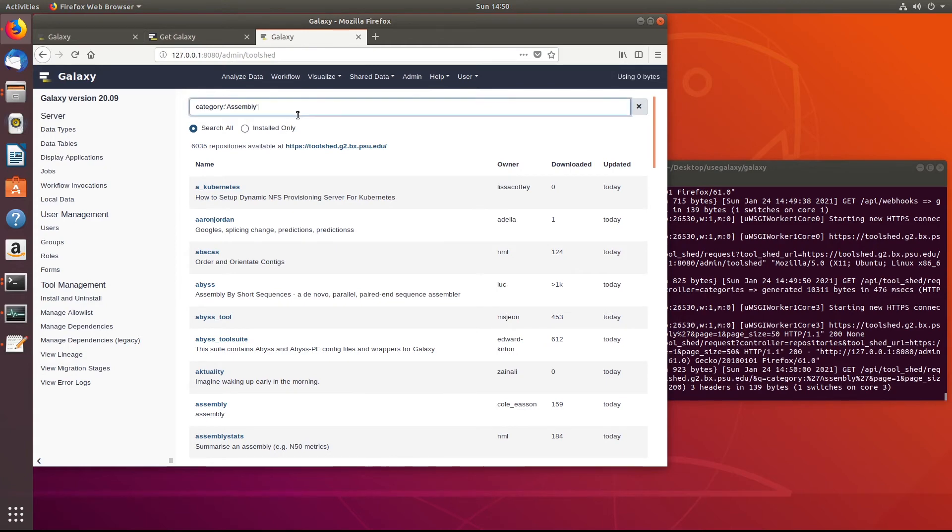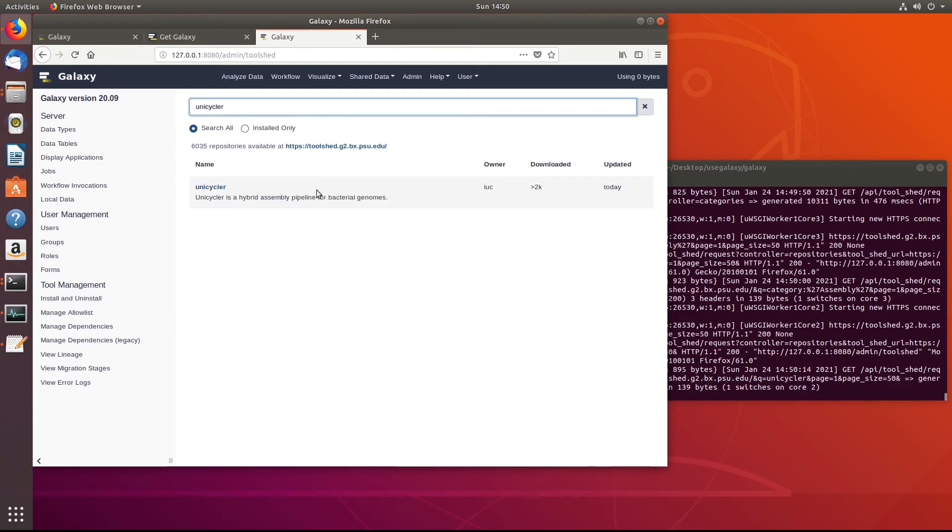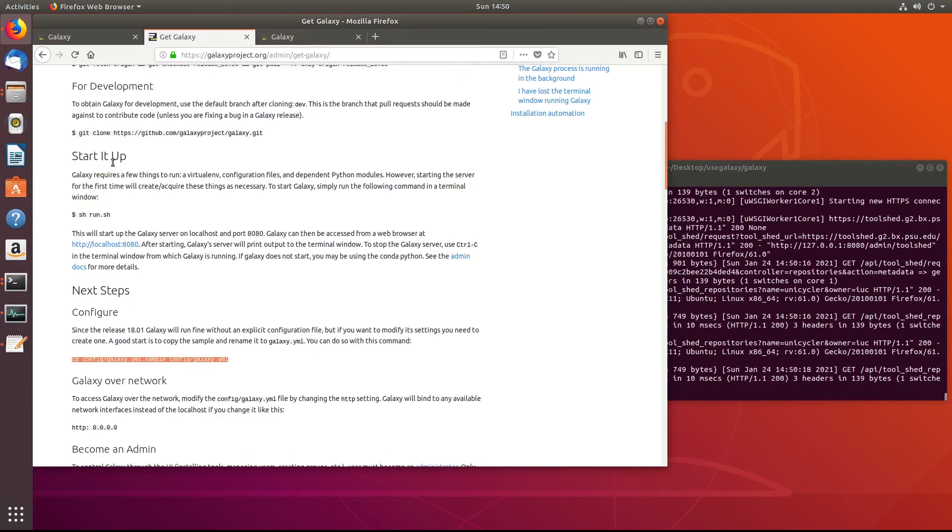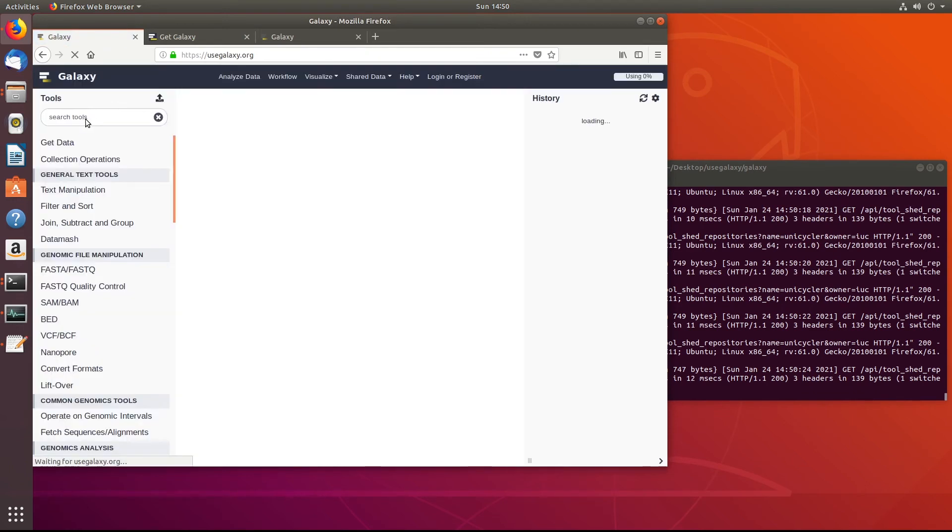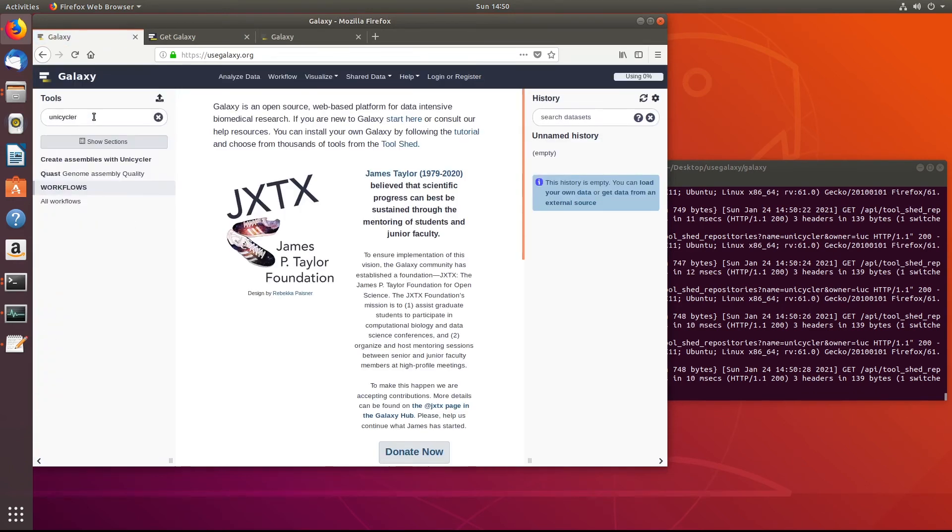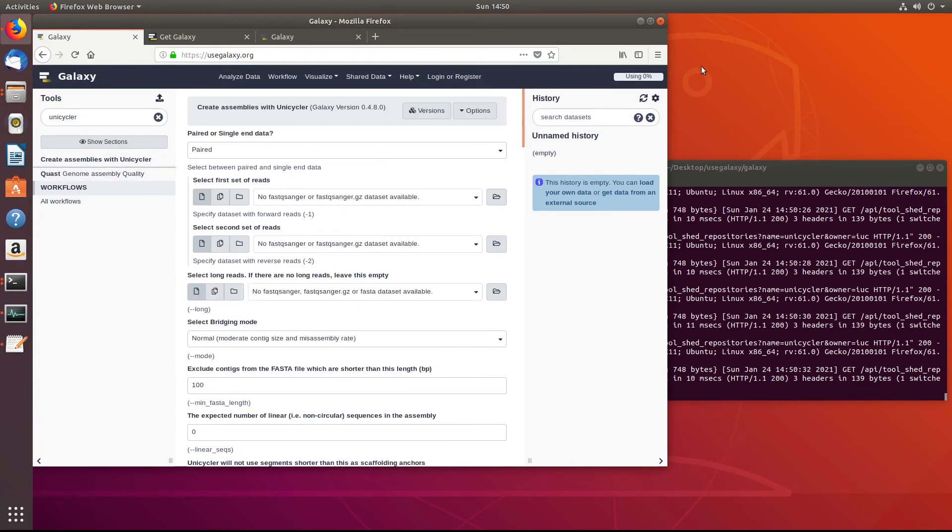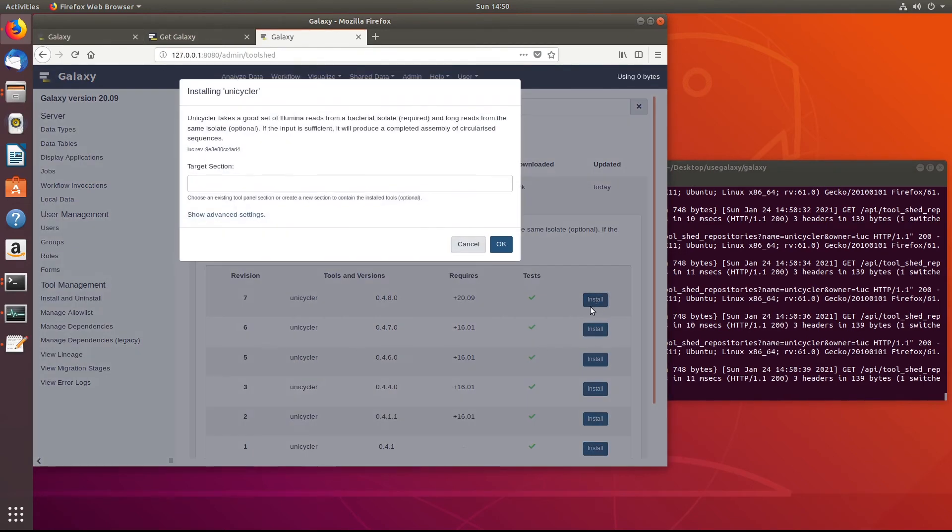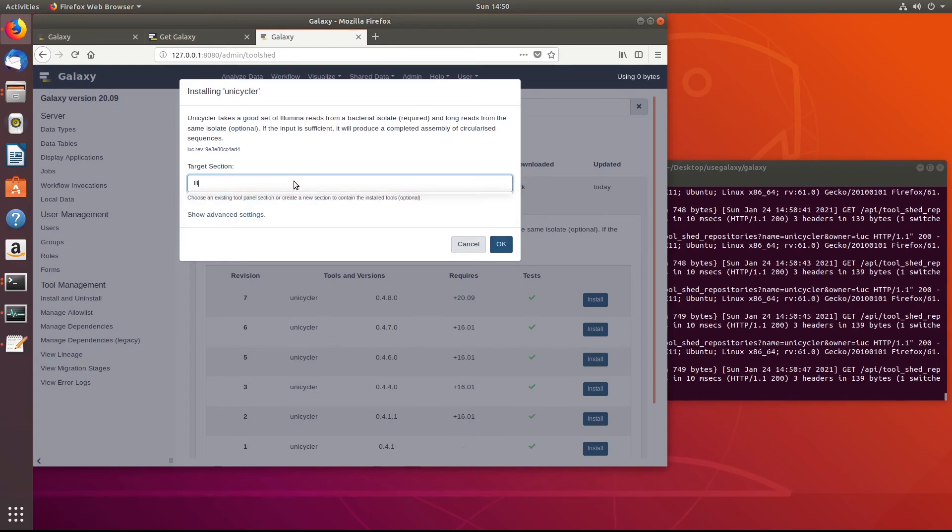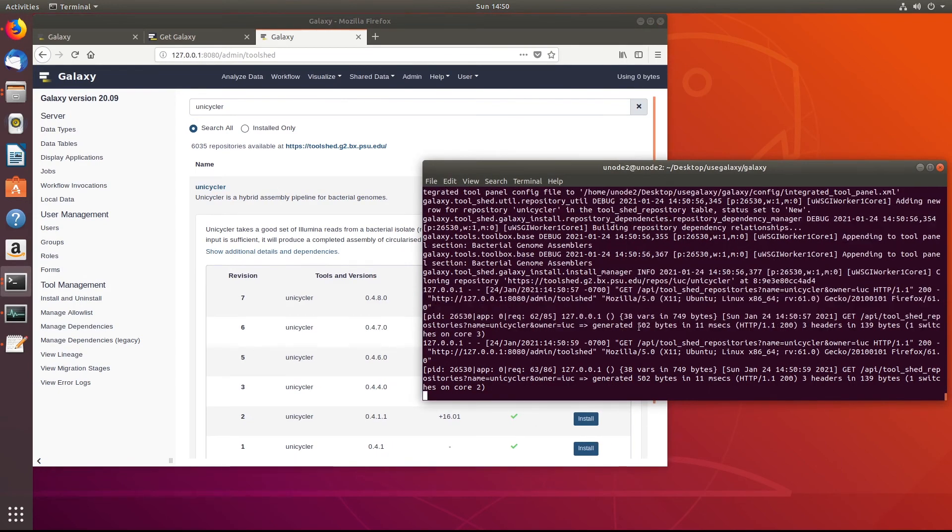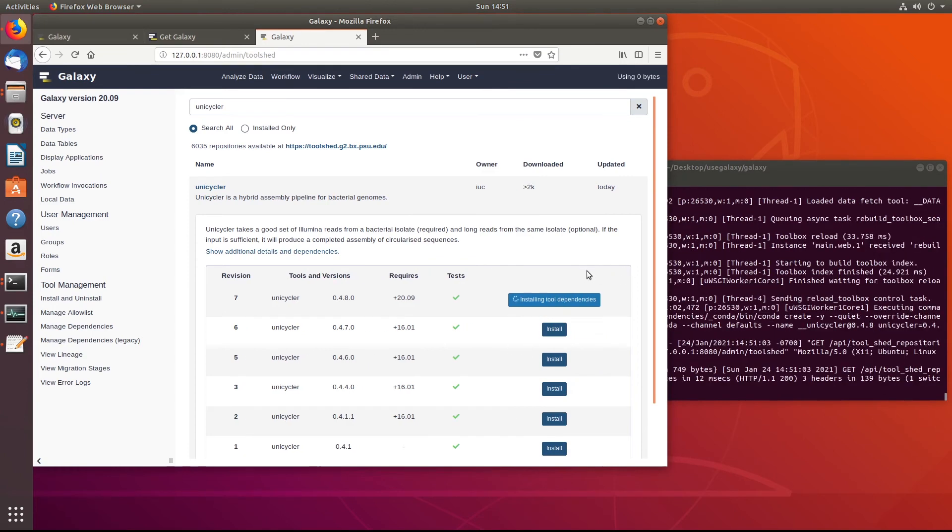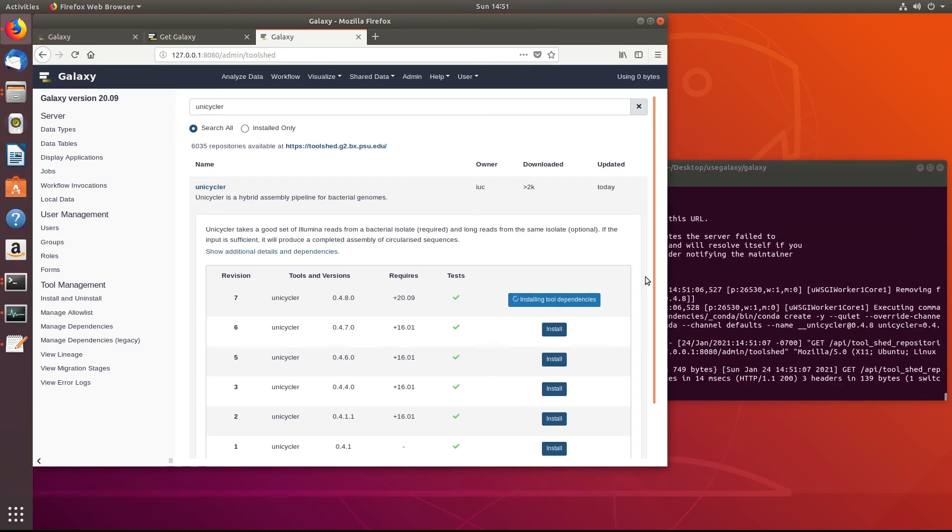Let's go ahead and search for unicycler. And here we have unicycler. So instead of having to go through and type it all out, what we could do is let's go back to analyze data up here. We'll search for unicycler. And we have this tool. So this is on the useGalaxy website, but if we go back to ours, we can select what version we want. So we probably want to install the latest version. We can install it. What target section do we want to put this in? Let's call it bacterial genome assemblers. And then we'll click OK. So now what it's going to do is it's going to go through, you can see in the terminal here, it's going to install that tool. And when it's done, it should give us a little bit of information here telling us whether or not it worked.